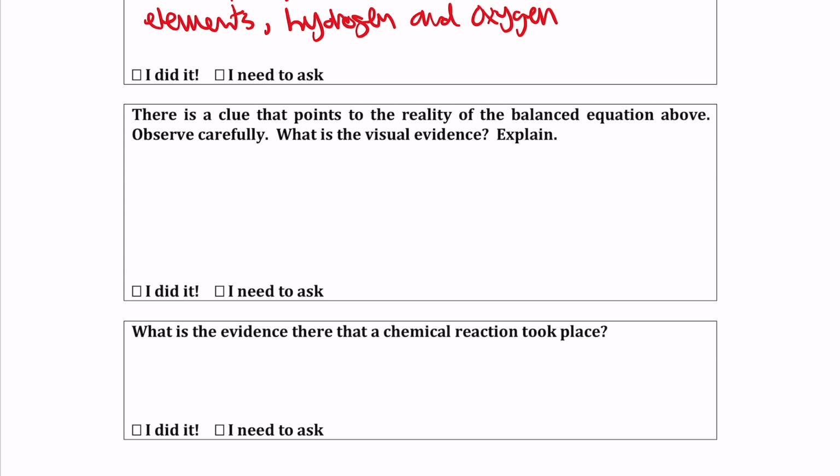And if you look at the two upside down cylinders, you can rewind if you want, you can see that on the hydrogen side, there's a lot more gas in them. It almost looks like it's more than double, to be honest, but in a perfect world, it would be double. But we can definitely see that there is more hydrogen than oxygen.